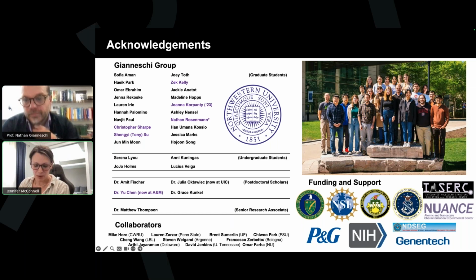So again, these materials are challenging. We've got a lot of people interested in studying soft materials. Is there an order of operations that you could recommend for somebody who is picking up a new soft material? They want to analyze it with TEM, in situ TEM, but where do they start? You probably don't start with TEM. I'm sure a lot of these other bulk-scale or ex situ analyses may be best first. What's the order of operations you would recommend for somebody new to soft materials?